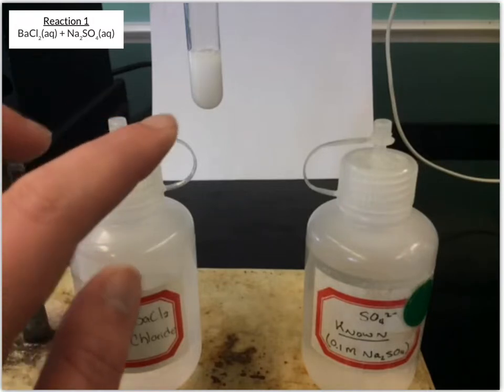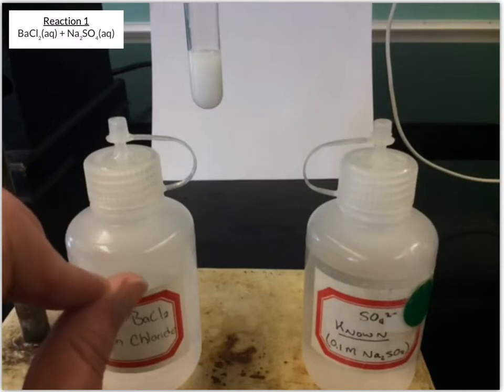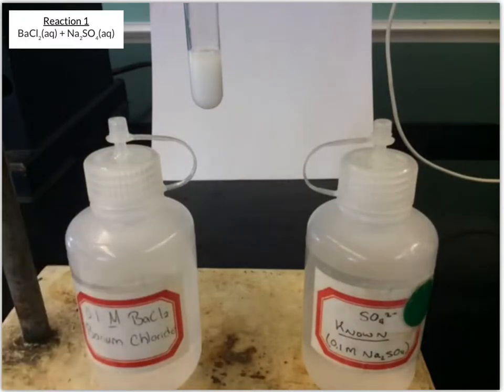Now, a lot of times when you see a cloudy type solution like this, it means that there's some solid floating around in it. Now, I'll go ahead and mix this a little bit, but then we're going to let this sit for a few minutes and see if a solid settles out. Because like I said, that cloudiness usually means that some solid formed, some precipitation occurred. And if you let it settle, you could either centrifuge it or give it some time to settle. You'll be able to see for sure is there solid in that solution.